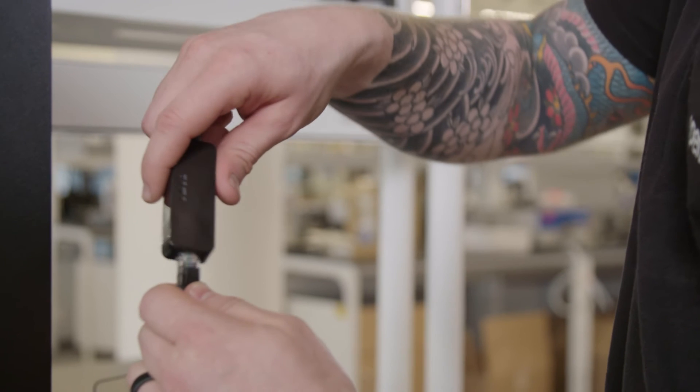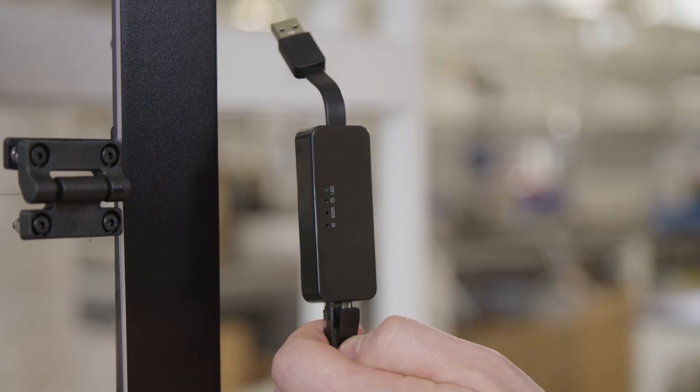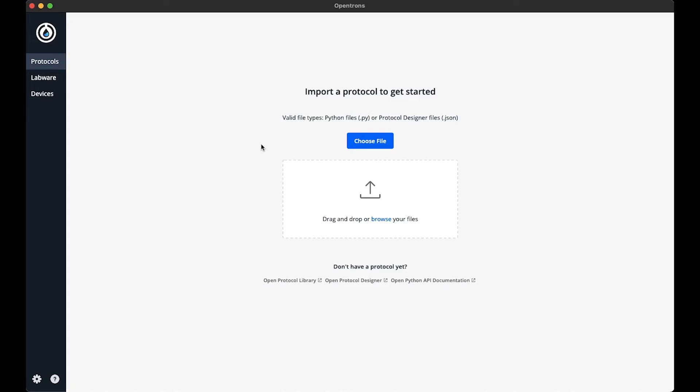For this connection, my computer also does not have an ethernet port, so I will need the supplied ethernet to USB dongle. Now that I plugged it in, I'll go back to the OpenTRONS app.